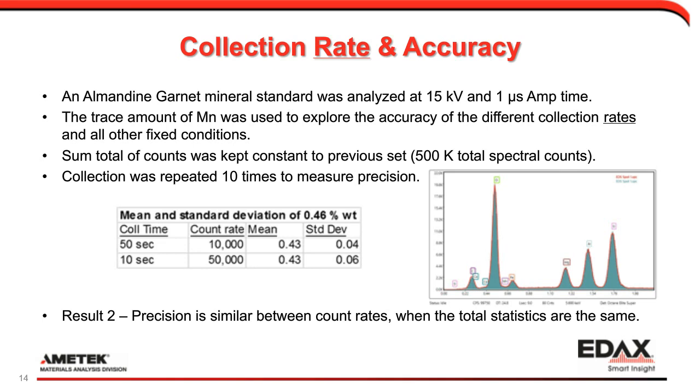So a whole lot quicker, right? We get to do a lot more data collection in a lot less time. It makes our jobs more productive, and it also makes us a little bit more interactive with the data and the software as we collect it. But the question is, do we lose anything by upping the count rate and decreasing the collection time? Do we have the same quality?